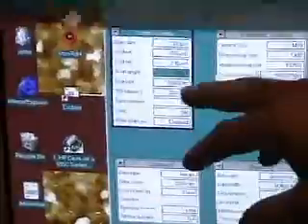So, okay, let's continue going down our list here. Scan rate determines how fast it's rastering back and forth to accumulate the images.